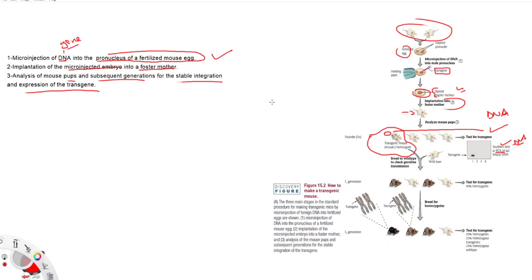And by PCR, since you know the gene very well, you could design a couple of primers that are going to anneal to your complementary region. And if the DNA is present, you should see in that gel bands like this that correspond to your DNA of interest.